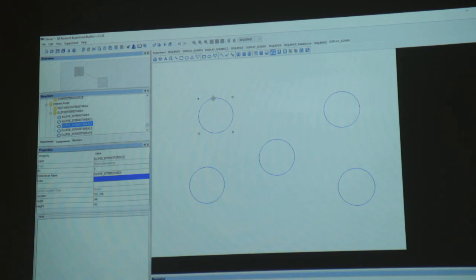It means multiple things. I could be in multiple locations. But because you want to interpret very precisely, you give the unique ID. Of course, if you forget, you can go back to your design and see what 3 was. So you don't have to remember it, but you have to make sure you're making it unique when you're designing.